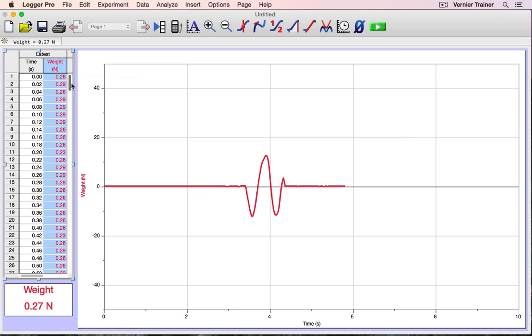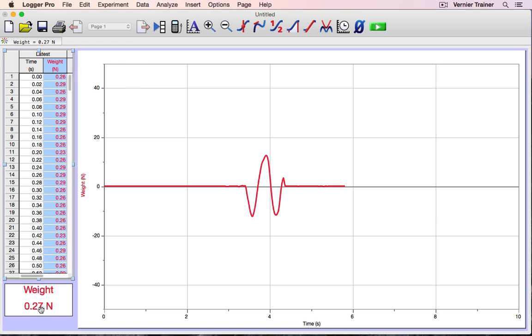That change is reflected both in the data table and my live readouts, as well as on the vertical axis of the graph.